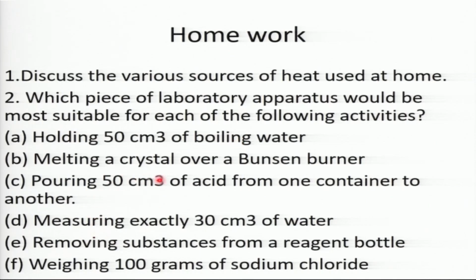Another thing, melting a crystal over a Bunsen burner. So I'm melting a crystal over a Bunsen burner. Which one should I use among what we have studied? Another one, pouring 50 cubic centimeter of acid from one container to another. Which one have I talked of that will help you to transfer a small amount of a liquid from one container to another? We have looked at that.